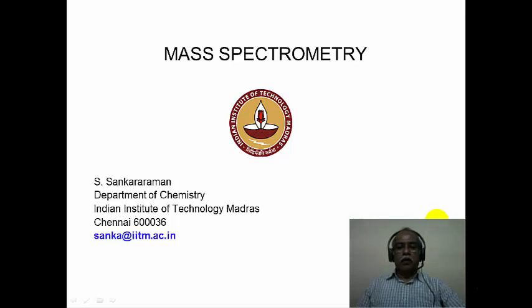Hello, welcome to Module 17 of the course on application of spectroscopic methods in molecular structure determination. In this module, we will continue with mass spectrometry and look into some aspects of electron impact ionization mass spectrometry and chemical ionization mass spectrometry. These are the two most widely used mass spectrometric techniques for structure elucidation of simple organic molecules with a molecular weight range of something like 800 to 1000 or so.